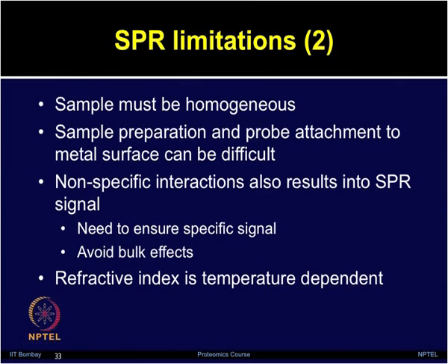Often non-specific interactions can also result into the false SPR signal. So, there is need to ensure that we can obtain specific signals from these experiments. Often the bulk effects can also be seen, which has to be avoided.